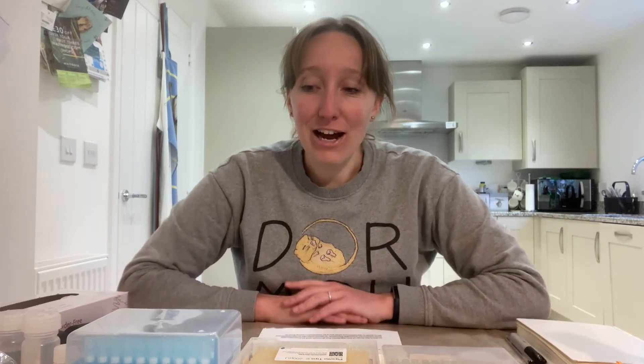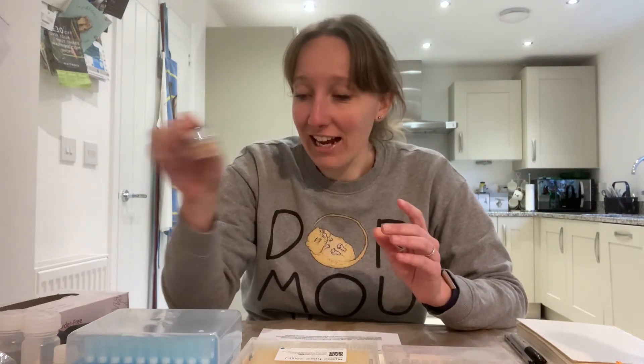Another tip: be a good housemate and give them a heads up that you're going to be doing some science in the house, and let them know that at some point there may be samples and reagents in your freezer or defrosting in the fridge. As long as you have the lids sealed on everything and store it in the correct conditions, everything is safe to be stored around food and drink, so don't let them worry that you're going to contaminate your fridge or freezer with anything nasty.